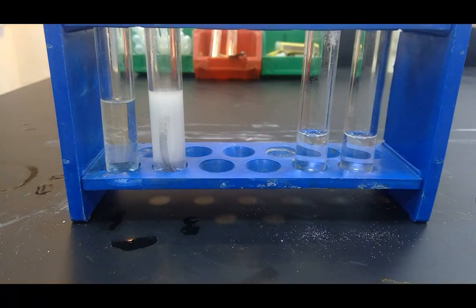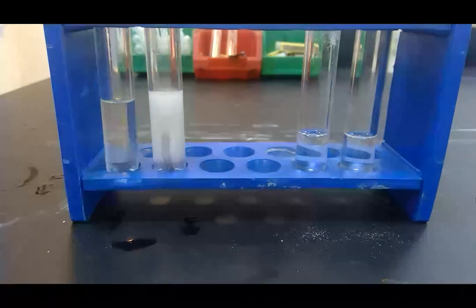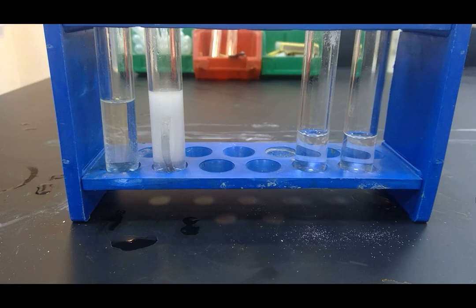You would also expect the reaction with the hydrochloric acid to produce more bubbles than the one with the ethanoic acid. At the beginning of the reaction, we saw quite a lot of bubbles from both of them, but we should see more bubbles at the beginning from the hydrochloric acid than the ethanoic acid, because the hydrochloric acid is stronger.